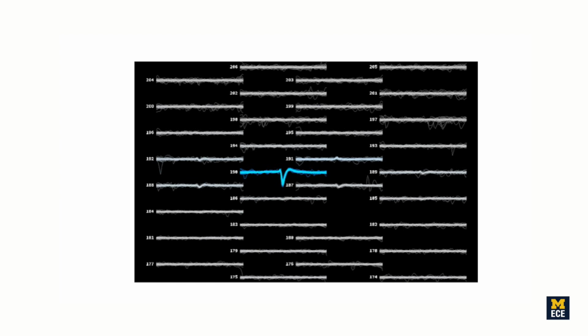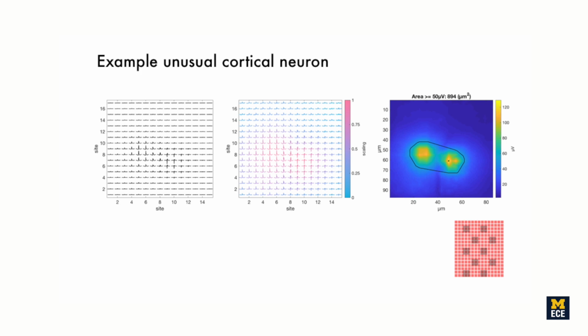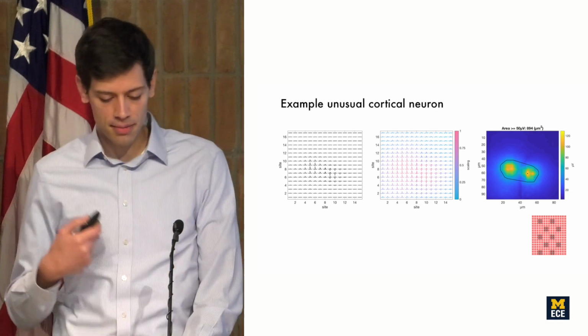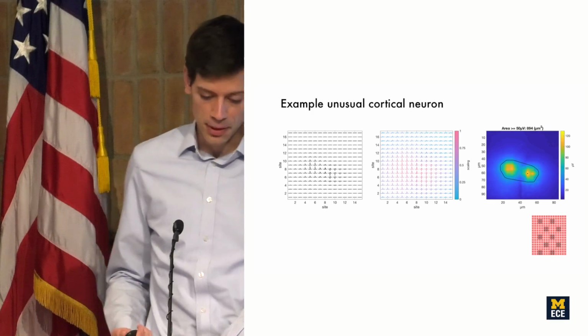And I think the other exciting thing about these data is they're really revealing some maybe interesting properties of some of these electrical fields that we really can't even see with the NeuroPixels, where, for instance, here there's both downward going and upward going action potentials in close apposition, presumably reflecting current sources and sinks related to different parts of the neuron's morphology. Okay, and then one other thing I wanted to say was that these very small neurons, we see them in the data from all of the brain regions that we recorded from. It's not just cortical neurons, but also hippocampal, thalamic, striatal, and cerebellar neurons.